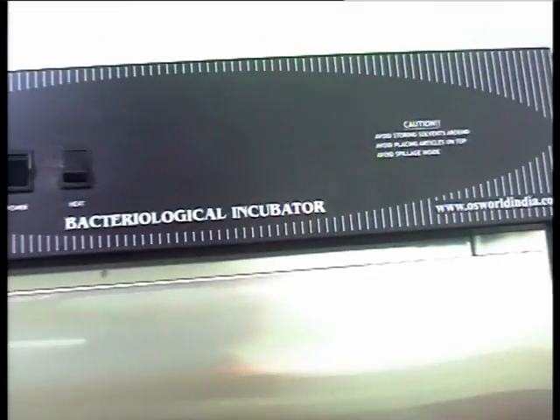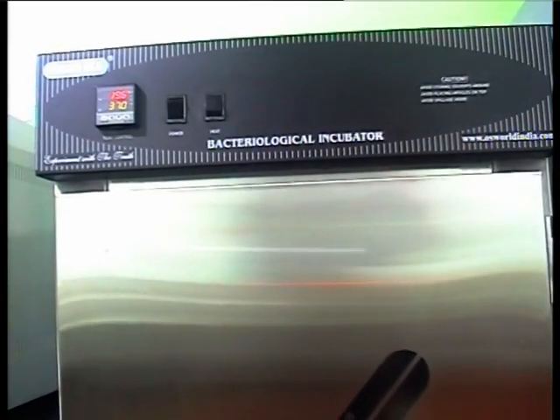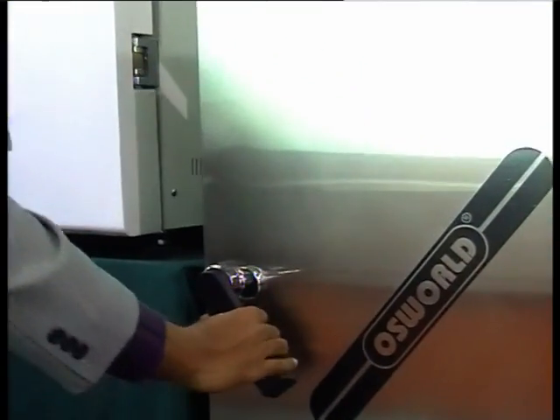The safety features of this incubator ensure personnel and equipment safety and life. This incubator is a device that complies with national and international regulatory agencies. It is provided with a calibration certificate accredited to the Electronics Regional Test Laboratory (ERTL) and traceable to National Physics Laboratory.